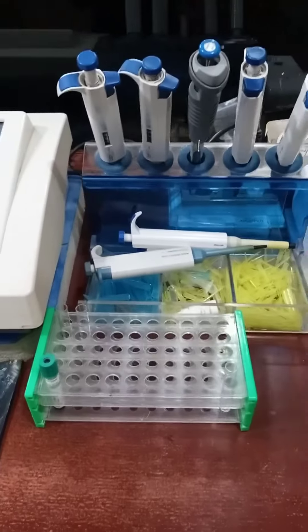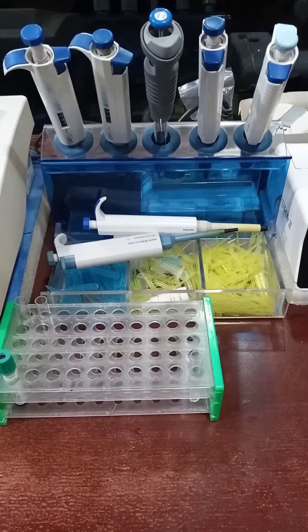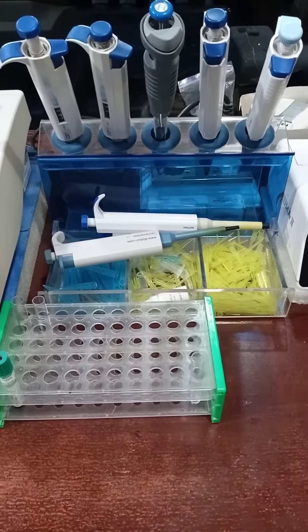These are different volume pipettes — 1000 microliters, 100 microliters, and 10 microliters, etc.